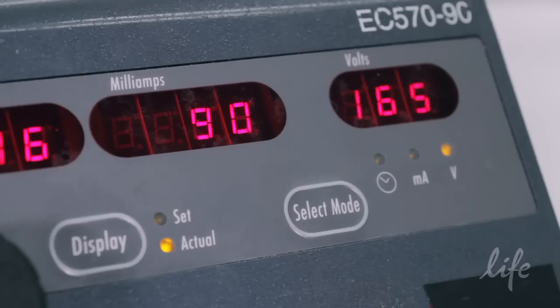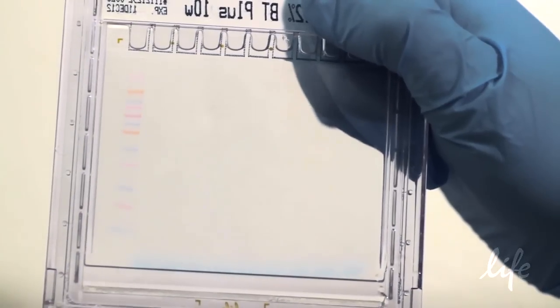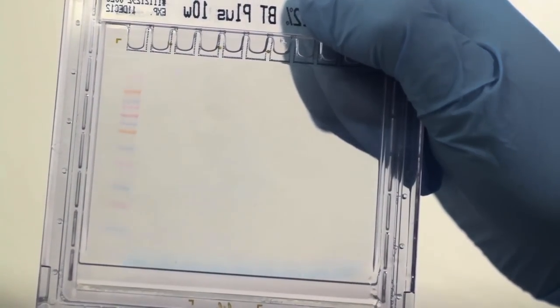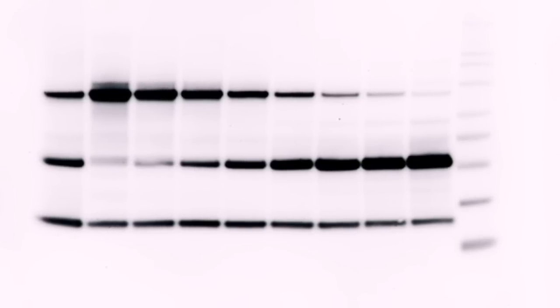The streamlined bolt tank is easy to set up and runs leak free. No more smeared or uneven protein bands. Now you can always enjoy straight sharp protein signal with greater sensitivity and resolution on all of your western blots.